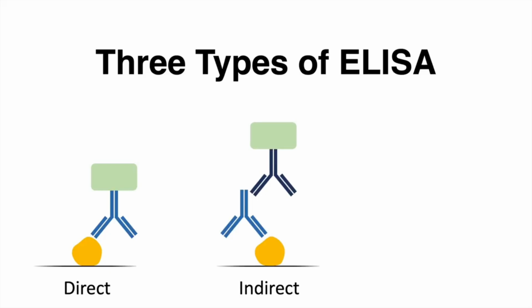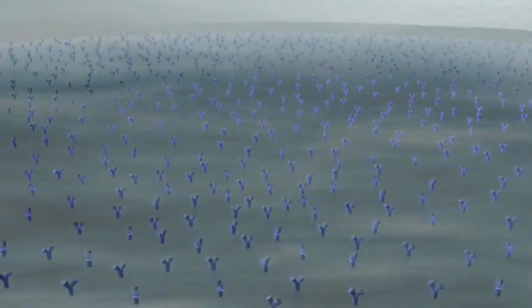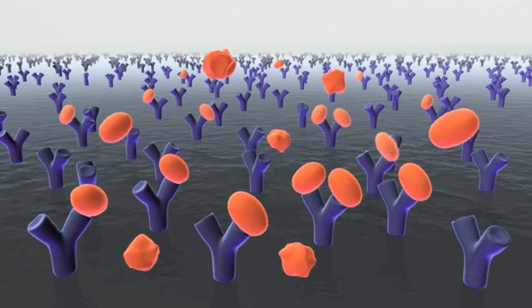So what are the advantages of direct ELISA? The advantage of direct ELISA is that it is a quick method since only one antibody is used. So this is very quick. You need not add a secondary antibody, so cross-reactivity of the secondary antibody is also eliminated. The disadvantages of direct ELISA are that the immunoreactivity of the primary antibody may be reduced as a result of labeling, and labeling of the primary antibody can vary from one experiment to another. Also, there is little signal amplification. But when you use secondary antibodies, signal amplification will be good.